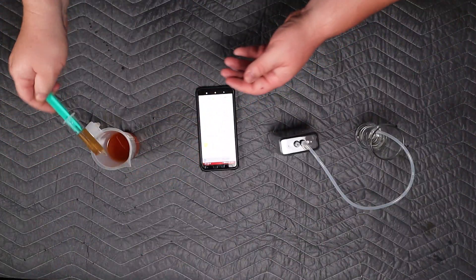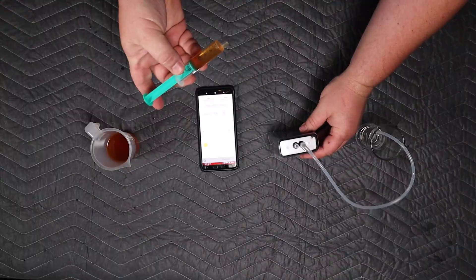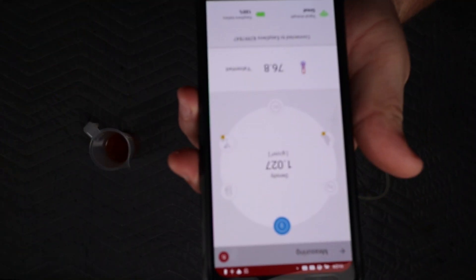So the first sample we are going to take some wort — it's wort I'm pretty sure, but it's another video you'll see. So we take that wort and then you're going to suck it up into your syringe and then basically push it through the Anton Parr, and very quickly — seriously, very quickly — you'll see that we get an instant gravity reading.